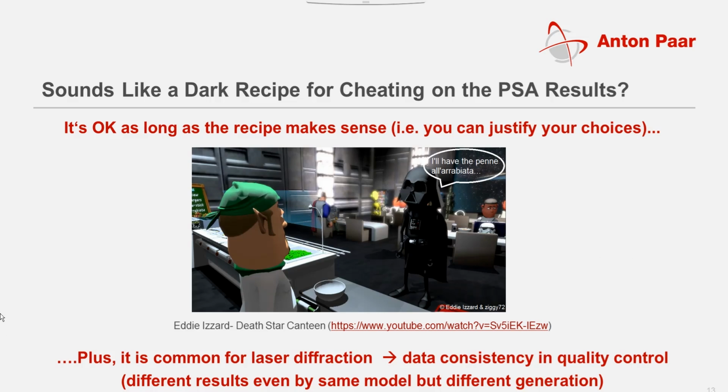My colleague Natalie found this sketch of Eddie Izzard on YouTube. Take once the time to see the video, which is very funny and fits perfectly in this context. There is also the link to the YouTube video. In our case, this is simply to underline that as long as you know what you're doing and you can justify your choice, it's fine. Moreover, the use of advanced parameters is common in the world of laser diffraction, where actually the main goal is data consistency in quality control and to get comparable results between instruments of different generation.